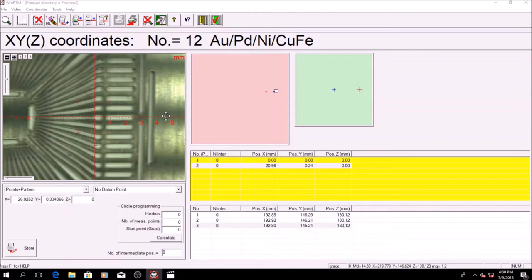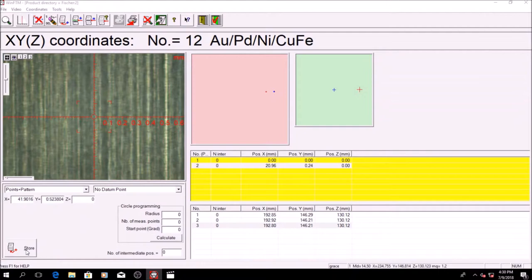Once complete, click save and exit. Afterward, click run to start the automated measurements. The measurement is complete.